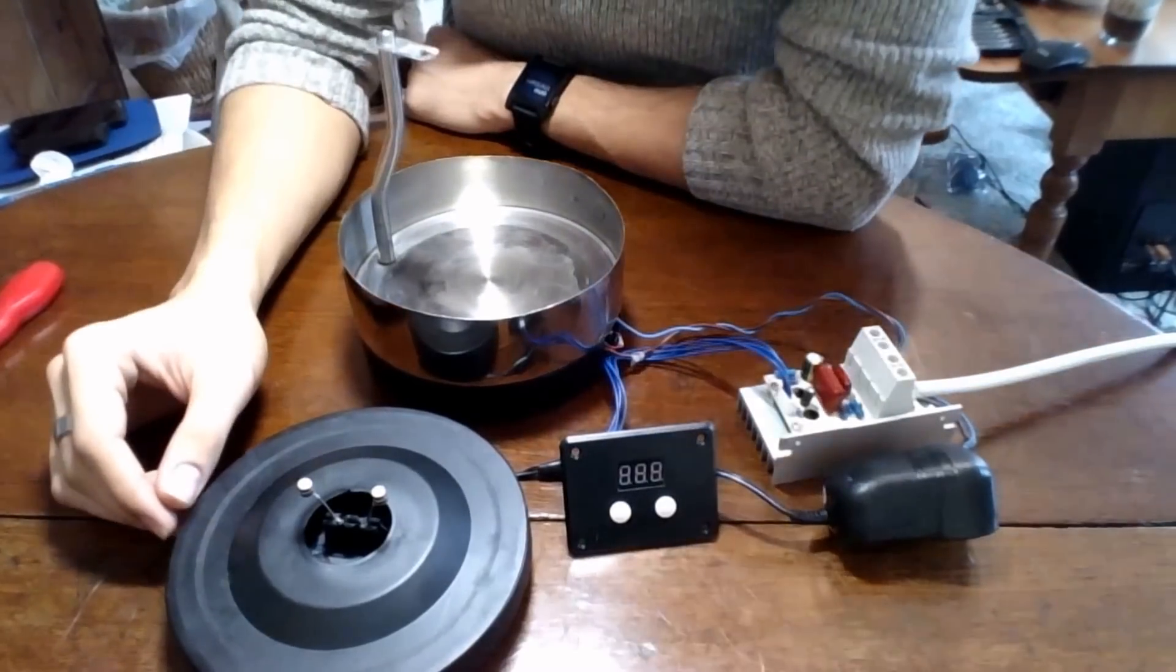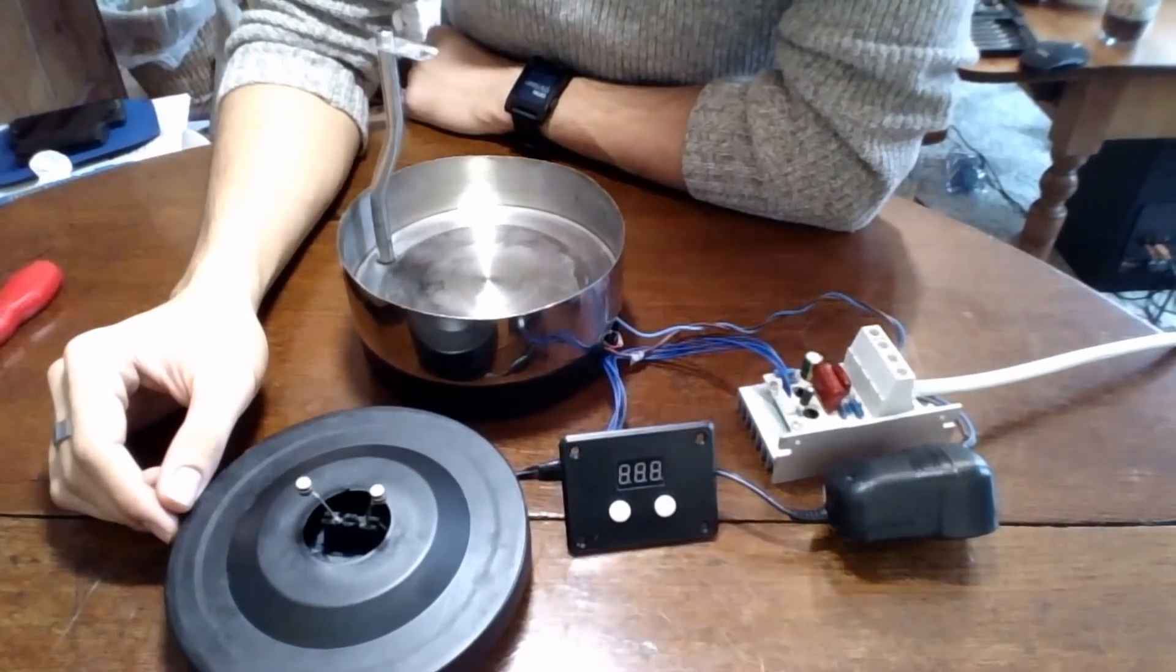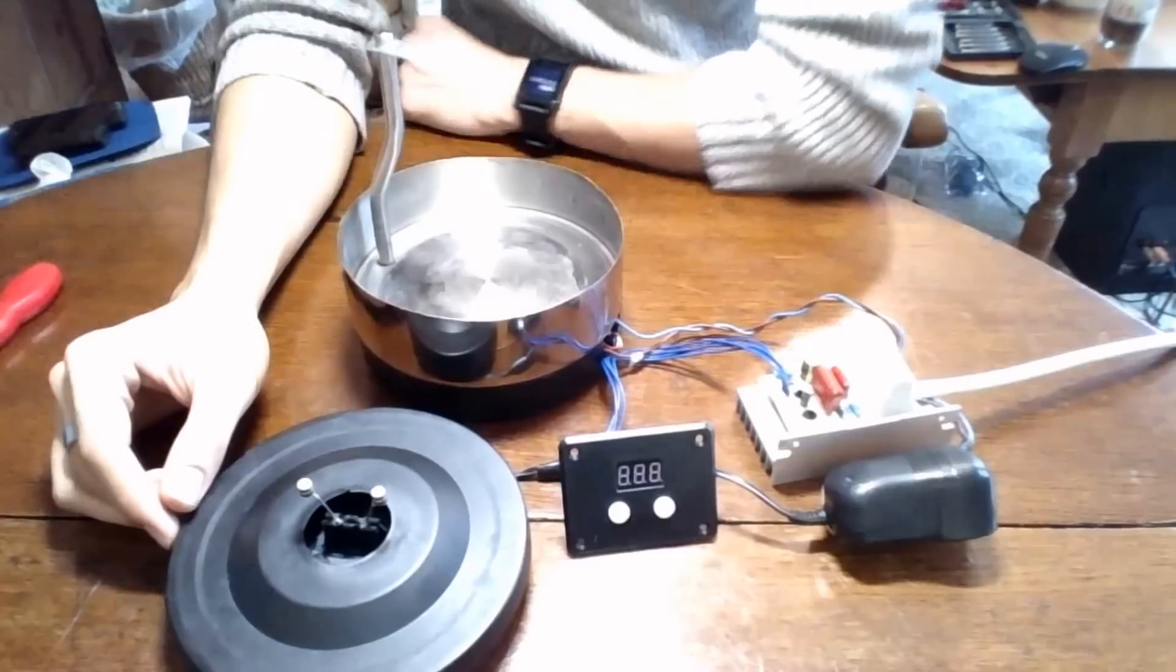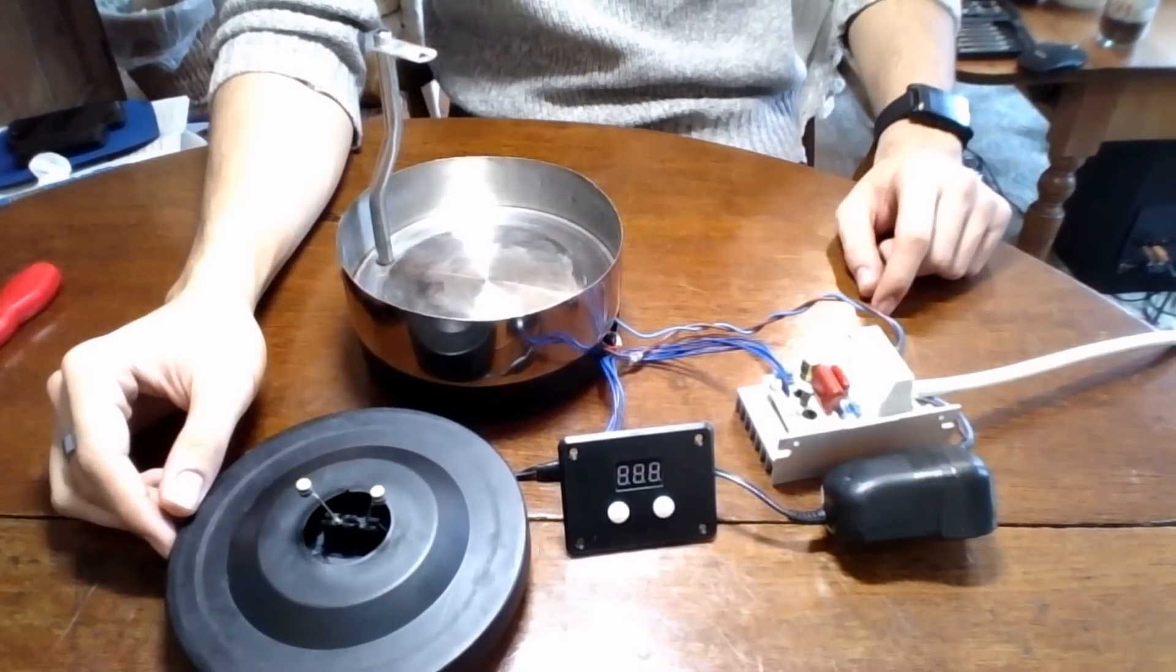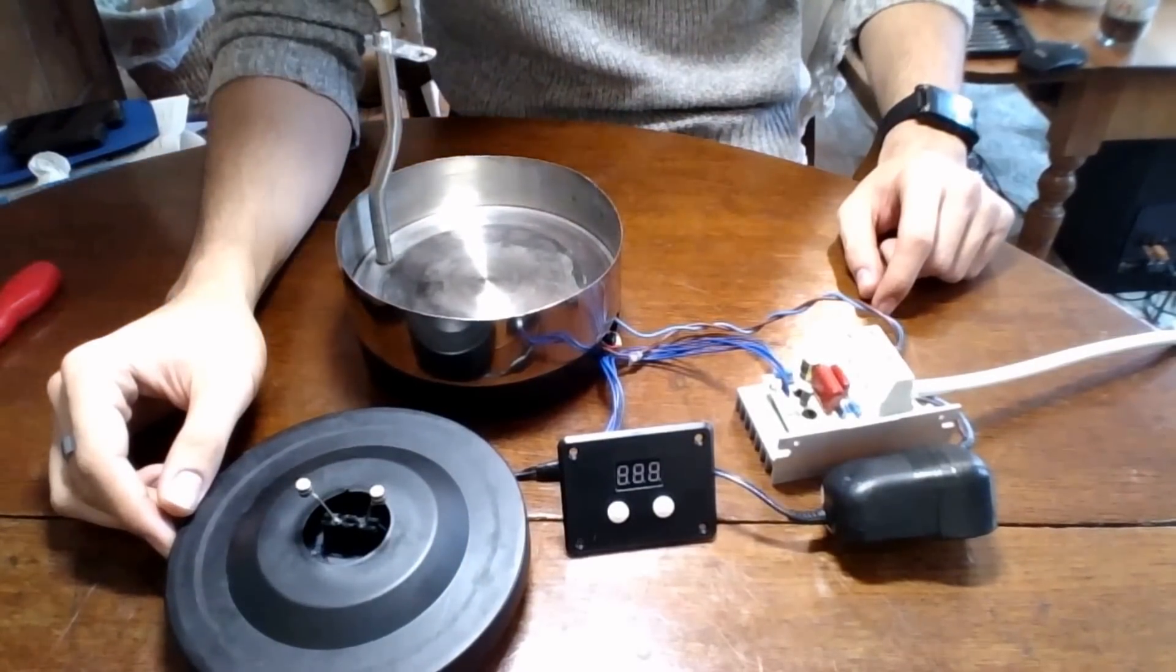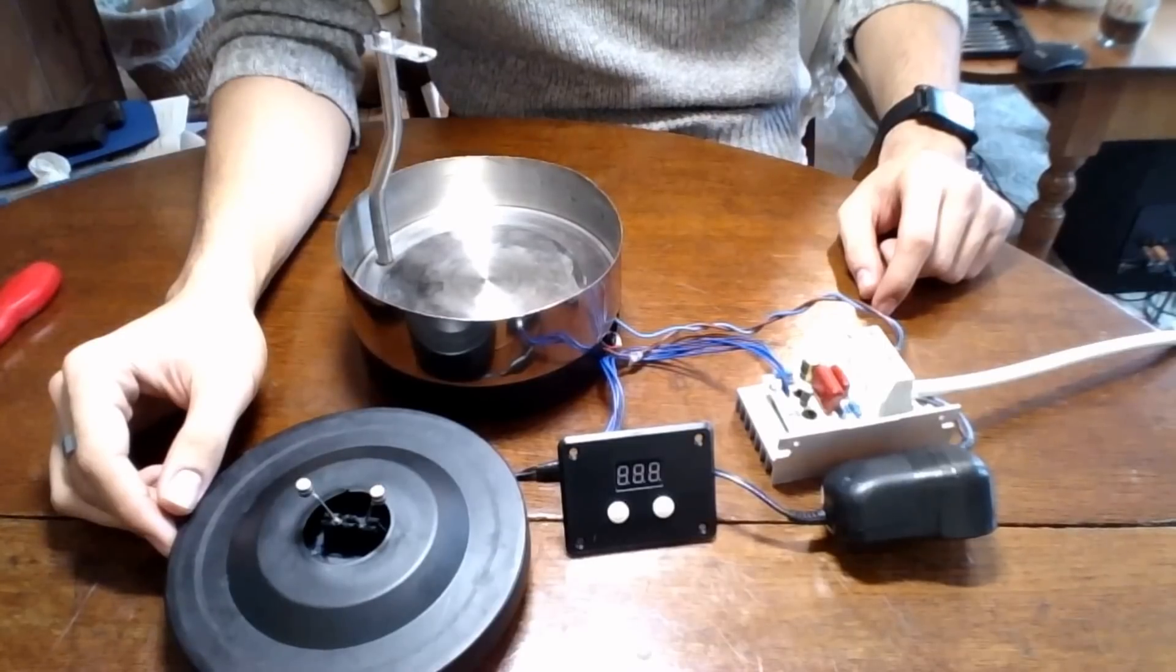Hey guys, I'm here today to show you how I've made this magnetic stir hot plate. If you haven't seen my video on how I made that magnetic stir, I'd recommend watching that one quickly to get an idea of how the mechanics work.